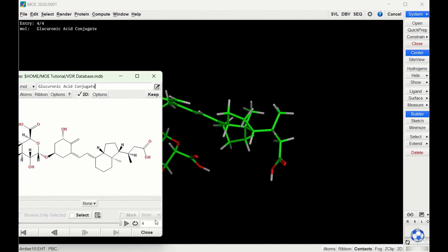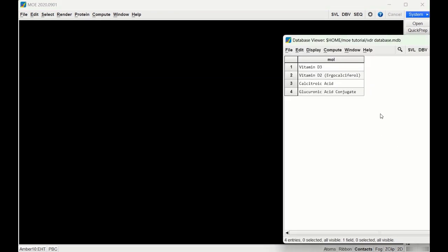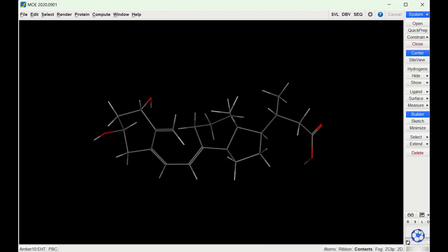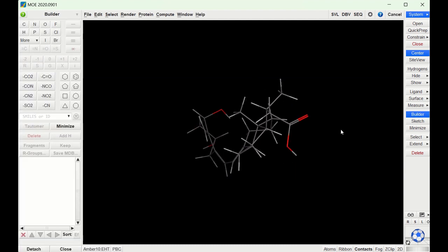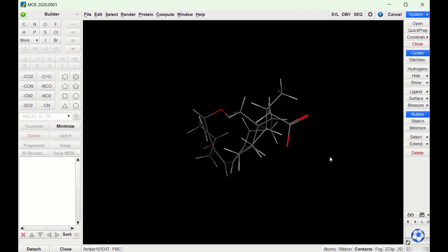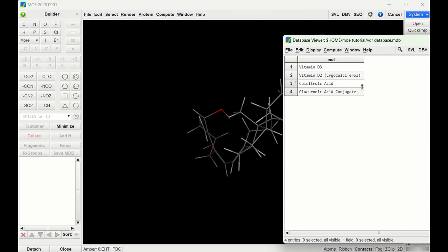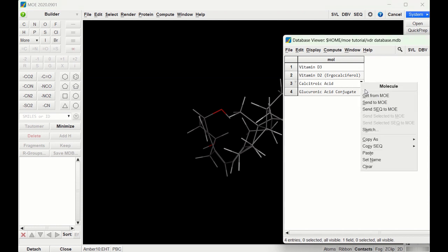To do that, we'll close our browsing window and go back to the database. We know that calcitroic acid also has carboxylic acid functionality on it, so we can send that to MOE — and we see the carboxylic acid here that is currently protonated. To deprotonate it, we go to Builder and press on the oxygen, then press the negative one charge, because if this is deprotonated it'll have a negative one charge. Once we press that, the hydrogen has been removed and we now have the deprotonated carboxylic acid. We chose a negative one charge so the hydrogen has been removed and we do have a deprotonated carboxylic acid with a negative charge. From here we go back to our database, go to calcitroic acid, click the dropdown, and click Get from MOE.